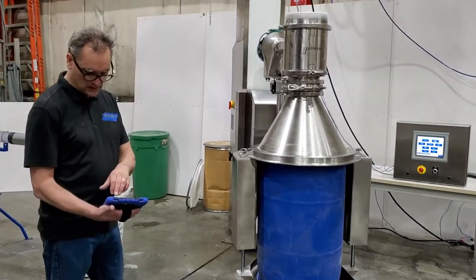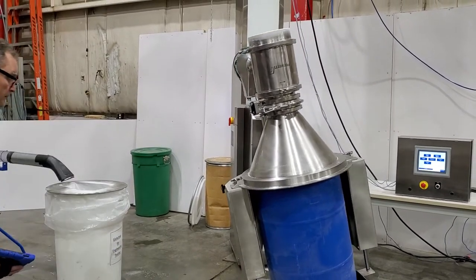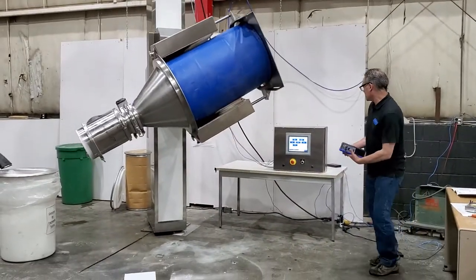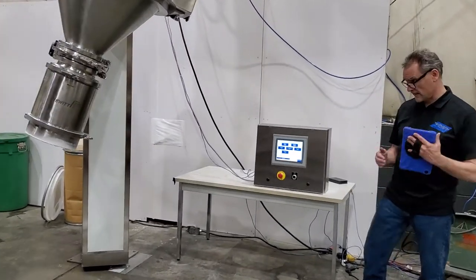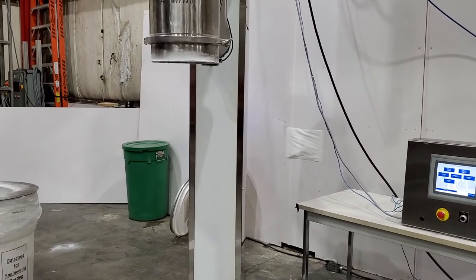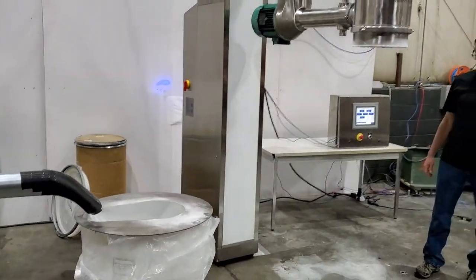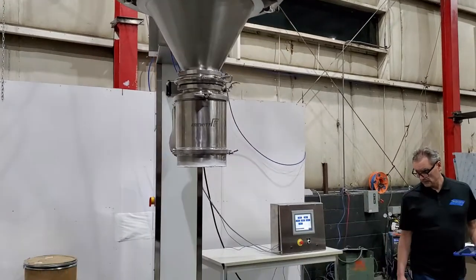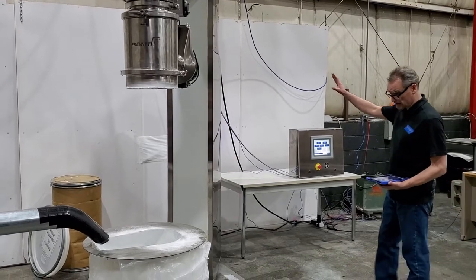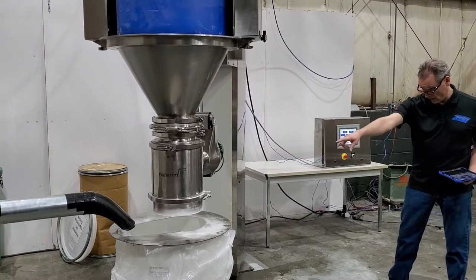Then we'll run a discharge. This is all typically done with the VHR line where you can use the tablet. It's going to position itself very accurately over the drum. No hardware level switches, no dead stops — wall position control, all digital, all very precise.